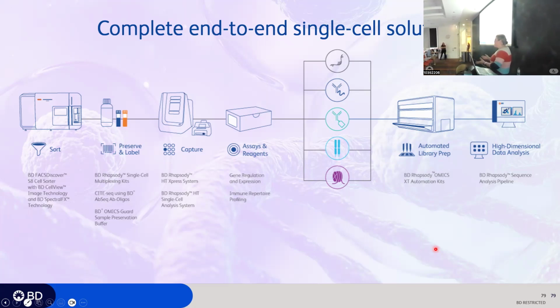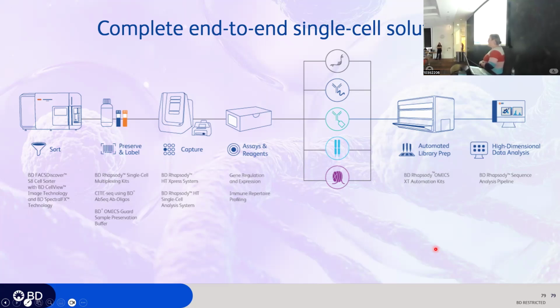As far as sample preparation, it's going to look very similar to any single cell experiment. You're going to want a nice single cell suspension with high viability, and a suspension clean enough that you have few multiplets. I think I have groups that get away with loading lower viability samples because we're able to wash away more of that debris because of the open well system.